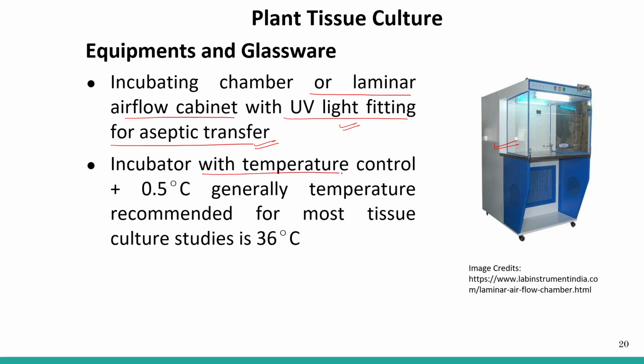Incubator with temperature control plus or minus 0.5 degrees centigrade. Generally, the temperature recommended for most tissue culture studies is 36 degrees centigrade. So you have to maintain a very specific temperature, so the incubator you require for that.